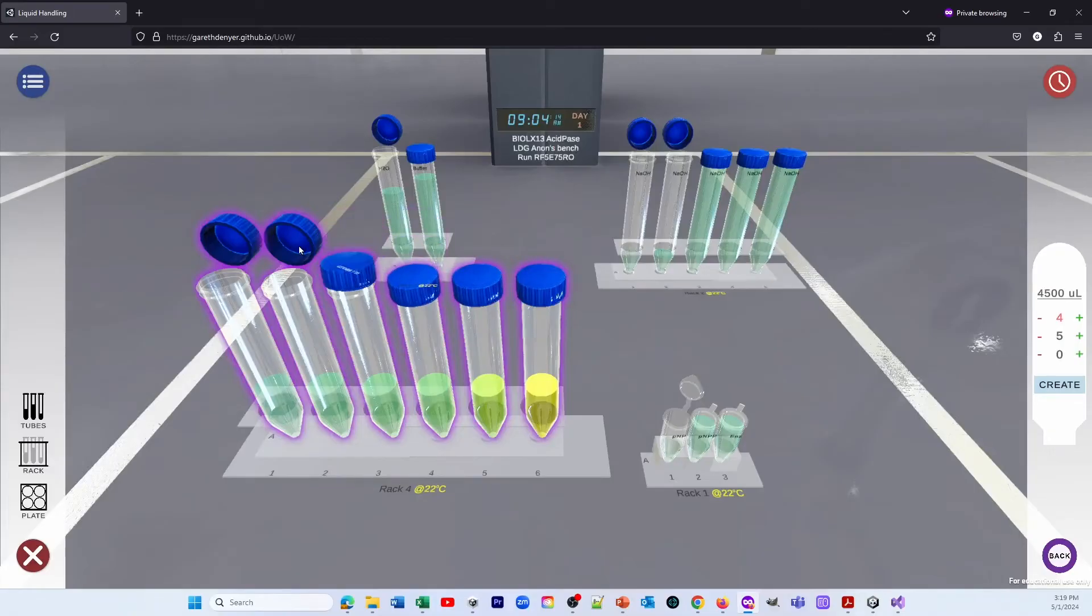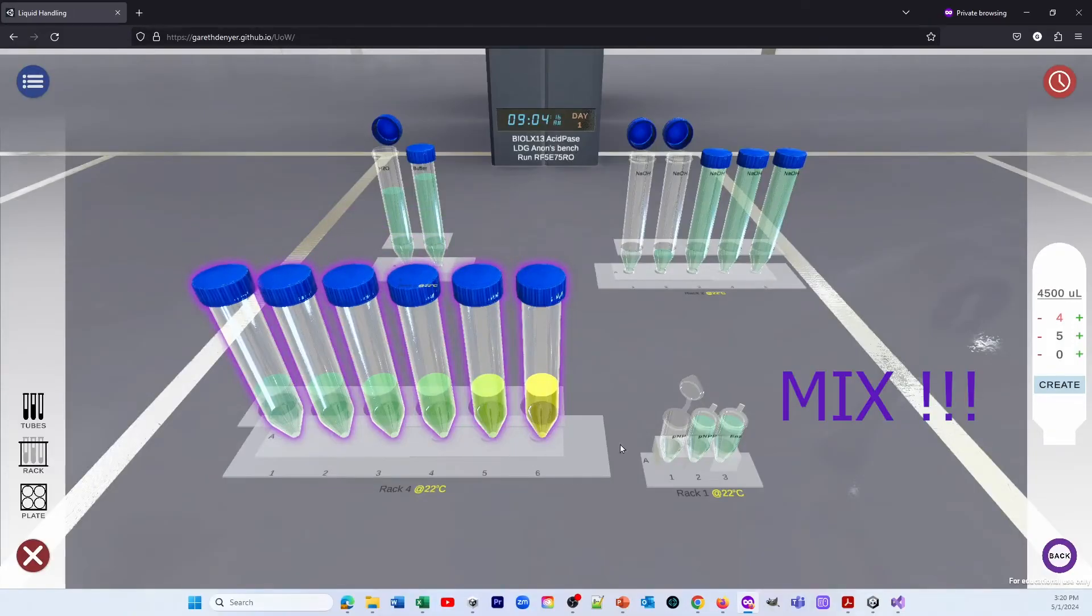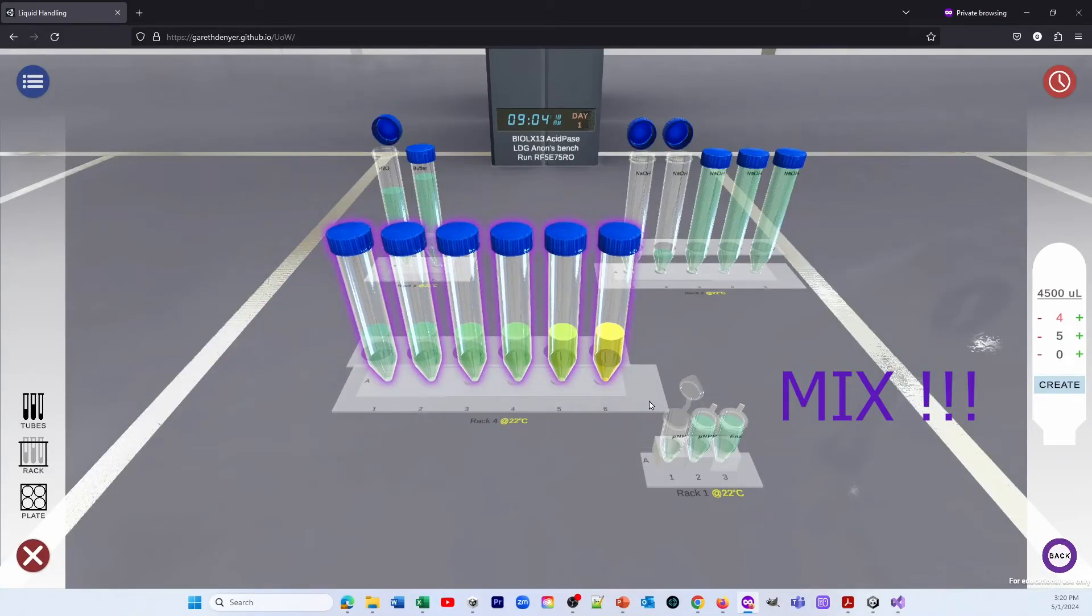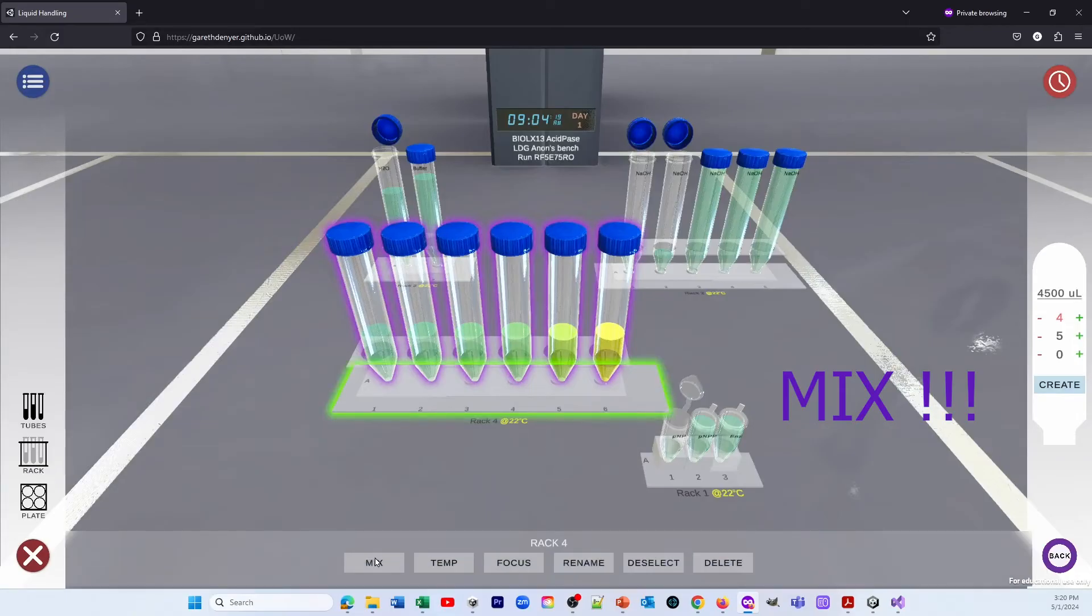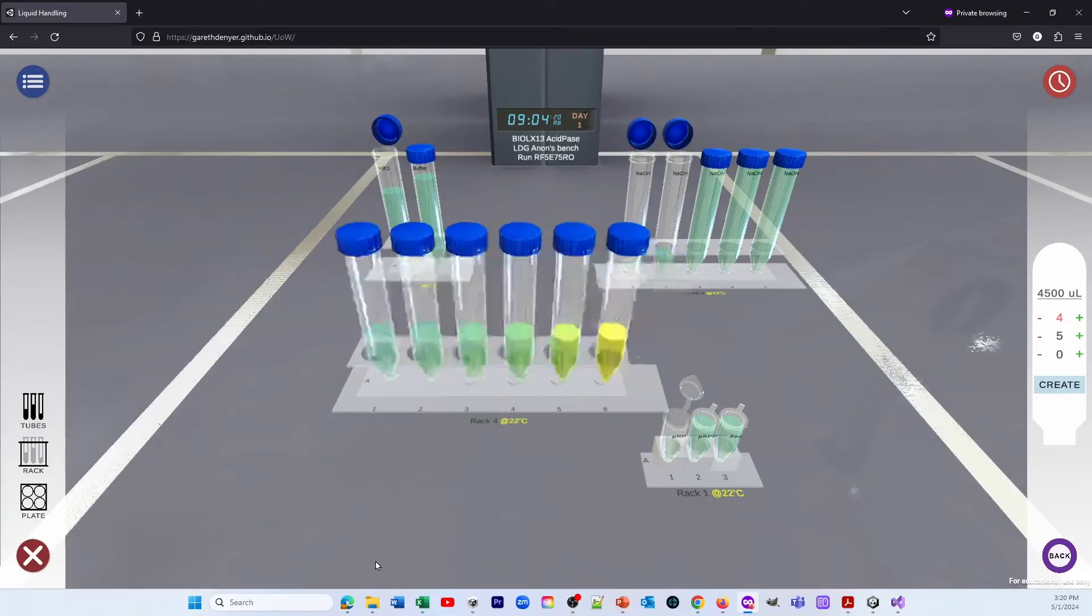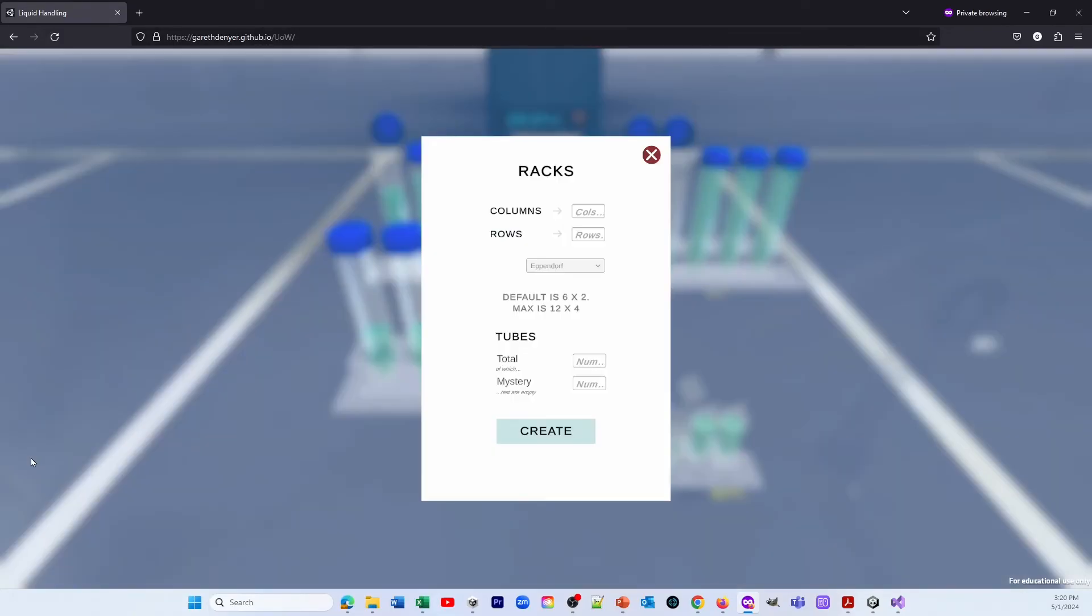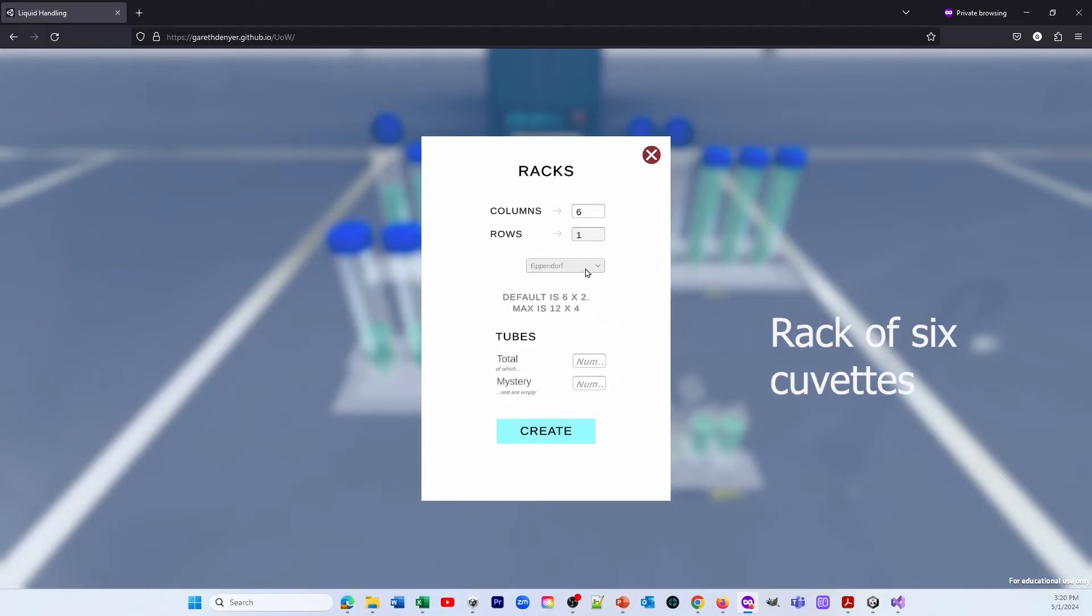So if we close the lids and give them a good mix, remember every time we see that purple outline, it's screaming mix, mix, mix. And now we could actually measure the absorbance of these by setting up some cuvettes.